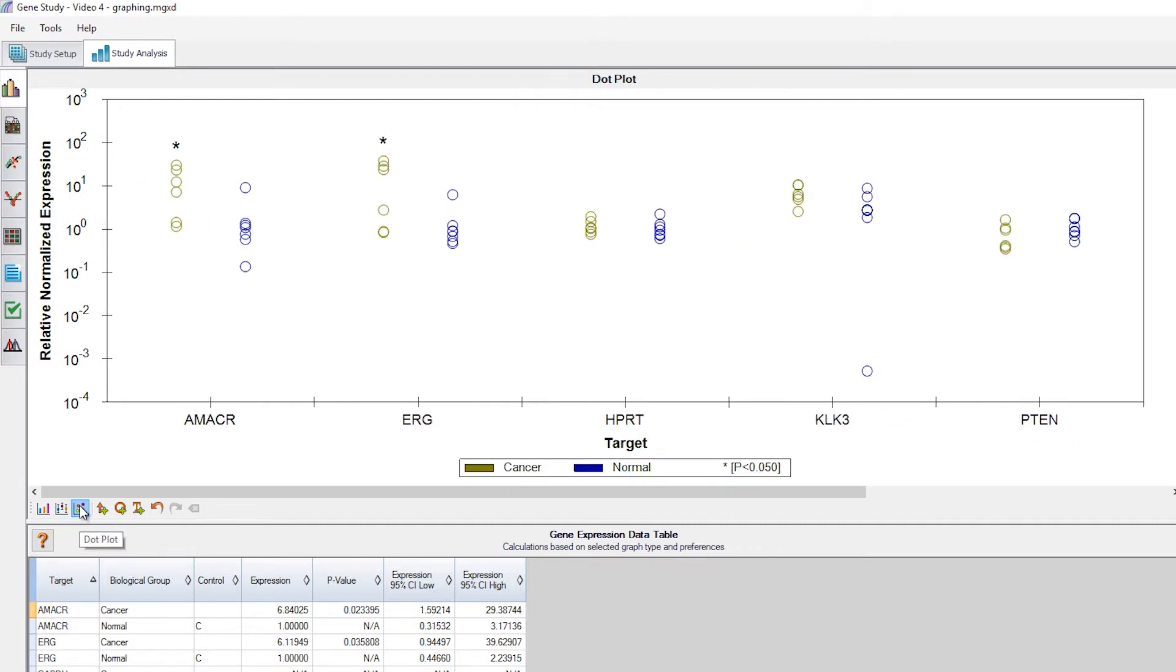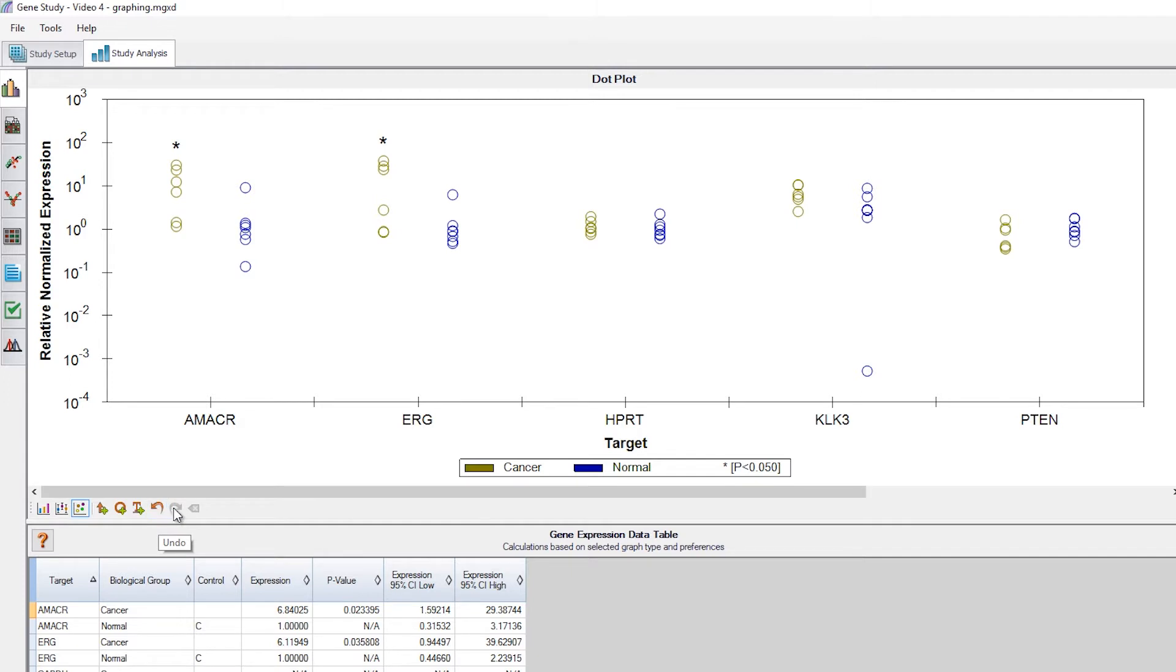The annotation tools available are add arrow, add circle, add text, undo, redo, and clear all annotations.